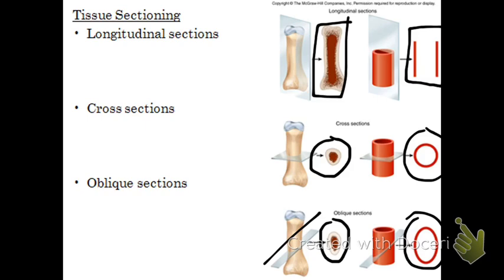Now let me just say straight up that we're not here to trick you on this. The images that we will share with you and expect you to know are, quote, standard, ideal images. These are images that are going to come from a number of sources: your textbook, your lab atlas, Mastering A&P, the lab manual, or PAL, the Practice Anatomy Lab program that's a part of Mastering. So as you look at these different sources and review these different tissues, the images that we will have you identify are ones that look identical to those or are extremely similar to those tissues. It will be important that you are able to differentiate them, but we're not going to be giving you odd angles or obscure tissues to examine or to identify.